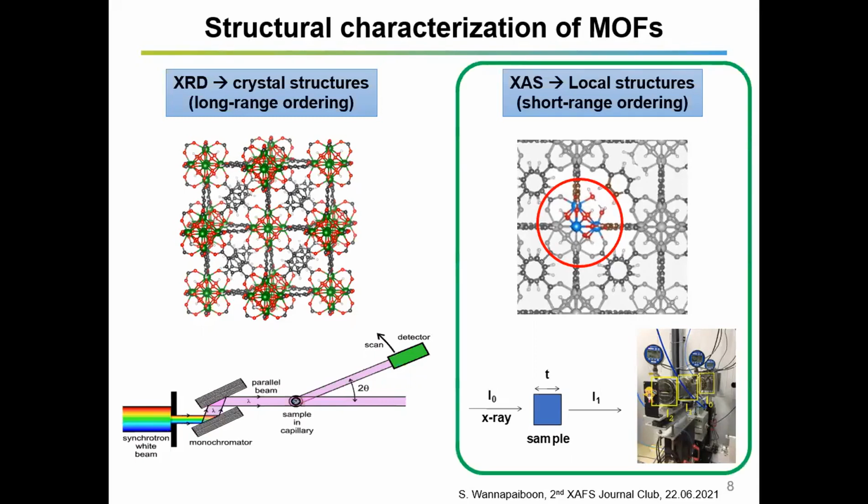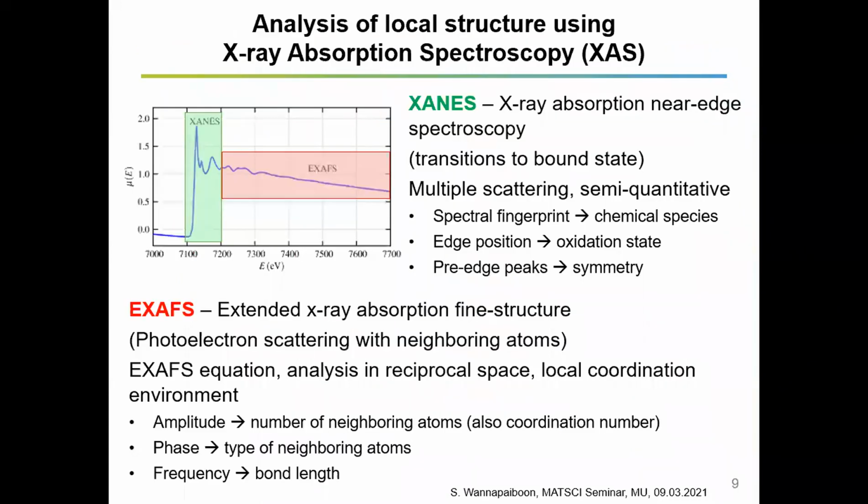So for the talk today, I would rather focus on the part where we use the X-ray absorption spectroscopy technique with metal organic frameworks. I will give you four of the works that we have done together with my colleagues during the past three or four years. Just to remind you a little bit about X-ray absorption spectroscopy.